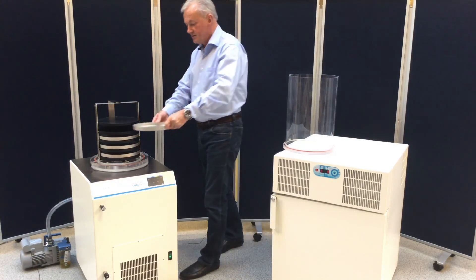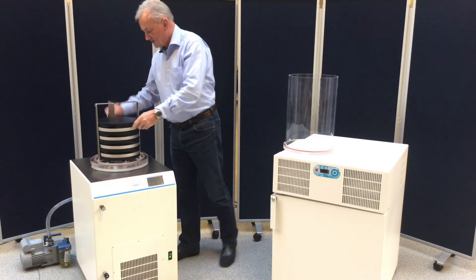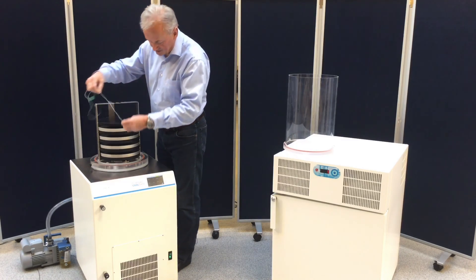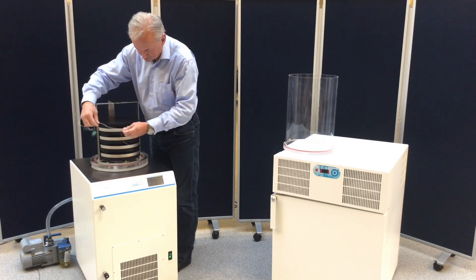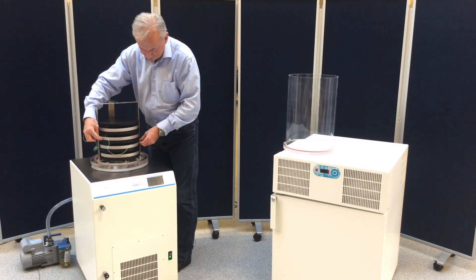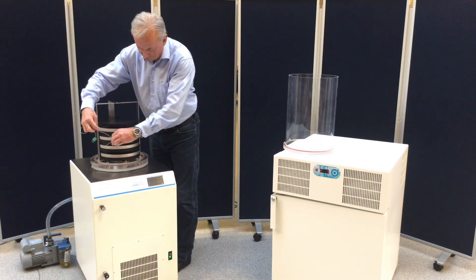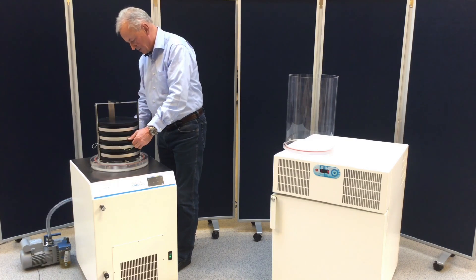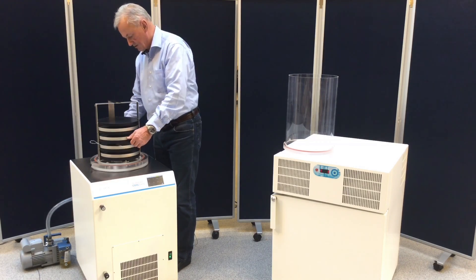Another thing you can do is mount a product sensor in the sample, so you are able to detect the freezing point and the temperature in the sample during the operation. Of course, normally that should be done before you make the sample frozen. Place it in a socket behind, and then you can detect the temperature of the sample.